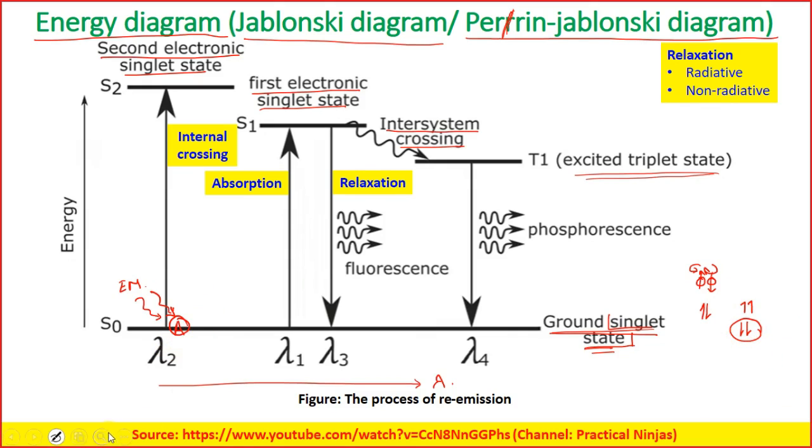If you see in the ground state, the electrons are always present in the singlet state.